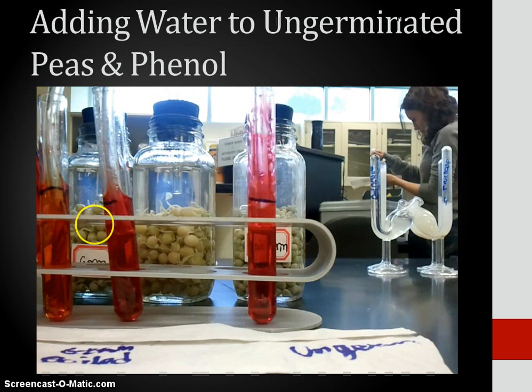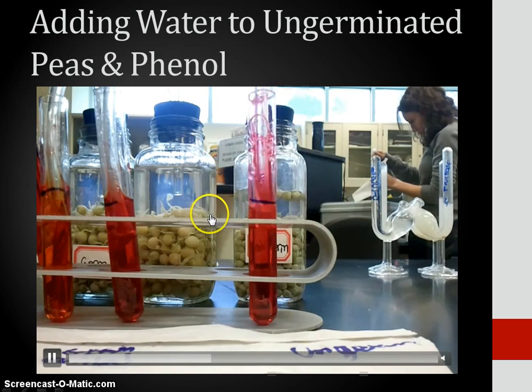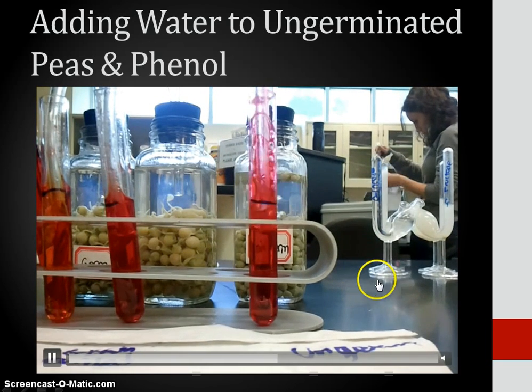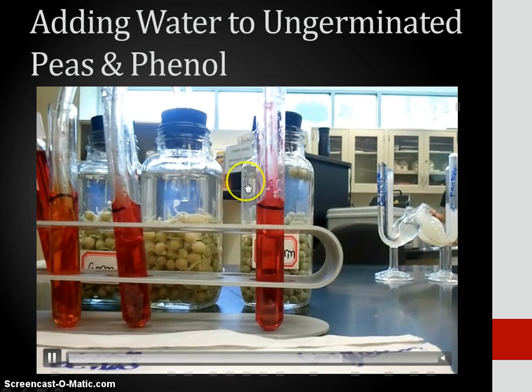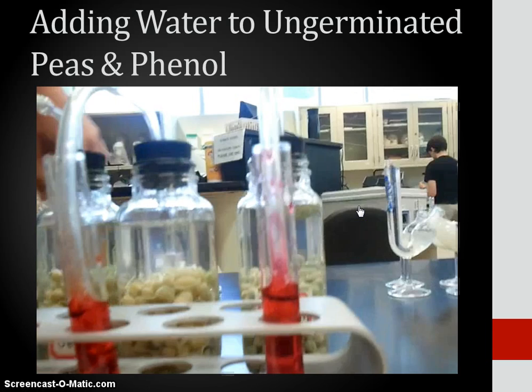Lastly, this is us pouring water into our ungerminated peas and phenol red. We can see that, yes, again, there are bubbles, very similar to the germinated boiled peas, but there is no apparent yellow, there are no signs of yellow. So what does this mean? No carbonic acid was displaced.